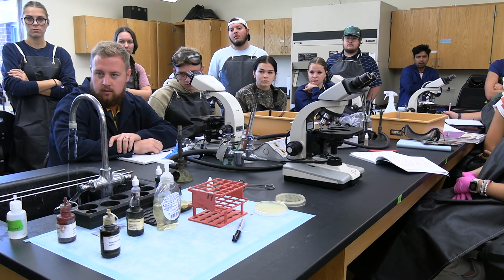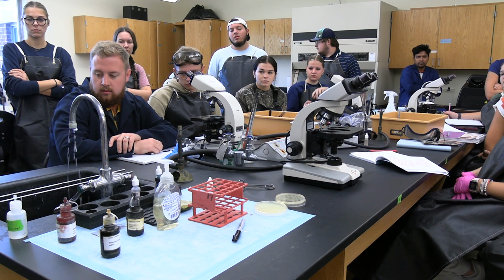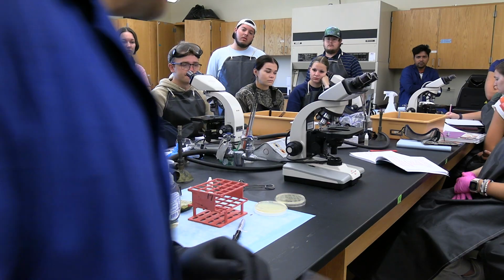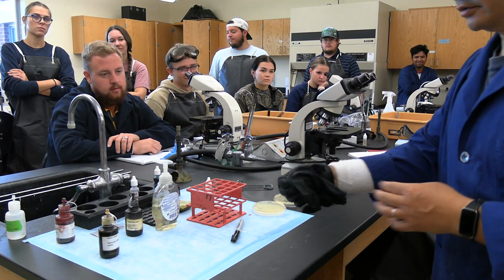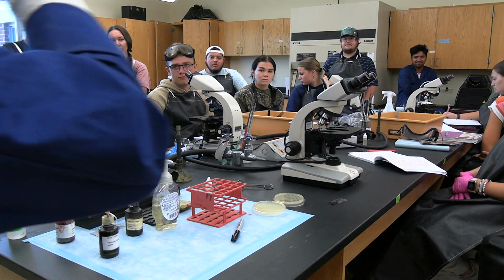So that is ready. And you can dry a little bit more because sometimes it's very wet. That's ready. Okay, now let's see what it looks like. I followed the procedure, but I didn't follow the time. I did it real quick, maybe 15 to 20 seconds. Let's see what it looks like. Sometimes it works, sometimes it doesn't work.